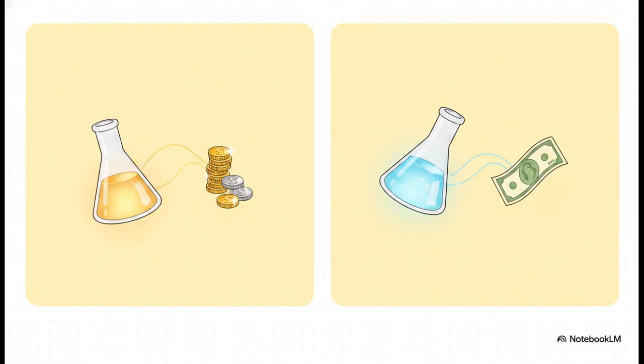Now, the sheer genius of back titration is highlighted right here. We actually run 2 flasks side by side. Our sample flask has the oil and the KOH, but our blank flask has just the KOH and alcohol, 0 oil. Why do we do this? Think of it like paying for a mystery item with a crisp $100 bill. That $100 bill, that's our blank. It's the total known excess of KOH we started out with. The cashier hands you back your change, right?